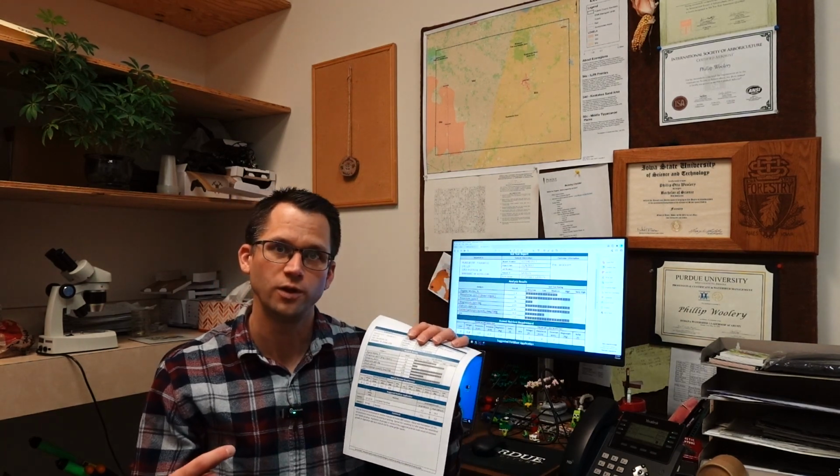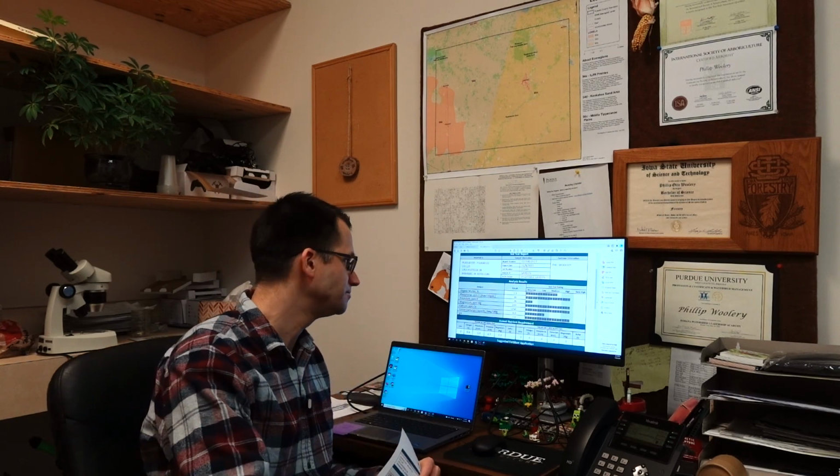In the last video, we looked at different methods you can use to collect an accurate soil sample from your garden to ship out to the lab. And now we have our soil test results back. In this video, we're going to take a look at them, what all these numbers mean, and some recommendations we can take from this report. So let's check it out.